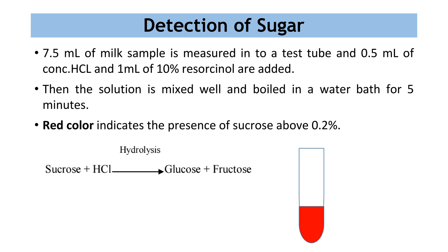Now let's see how to detect sugar. For that, 7.5 ml of milk sample is measured into a test tube and 0.5 ml of concentrated HCl and 1 ml of 10% resorcinol are added. Then the solution is mixed well and boiled in a water bath for 5 minutes. Red color indicates the presence of sucrose above 0.2%. Here you can see how sucrose reacts with HCl and forms glucose and fructose.